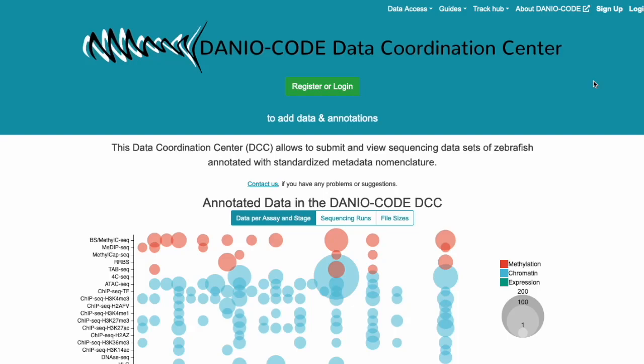A quick example on how to use the DanioCode DCC as a resource for biological research. Let's say you want to find out at which time a certain gene is present in zebrafish development.